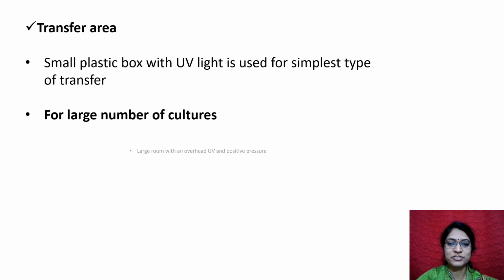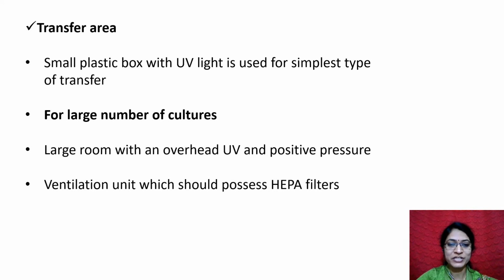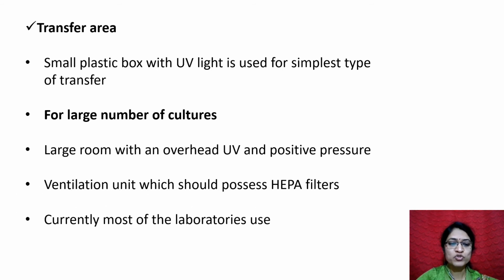For a large number of cultures, we must use large rooms with an overhead UV and positive pressure. The large room must be sterilized by using some chemicals, and must have UV light. A ventilation unit must be there, which should possess high efficiency particulate air filters. Currently, most of the laboratories use laminar airflow.